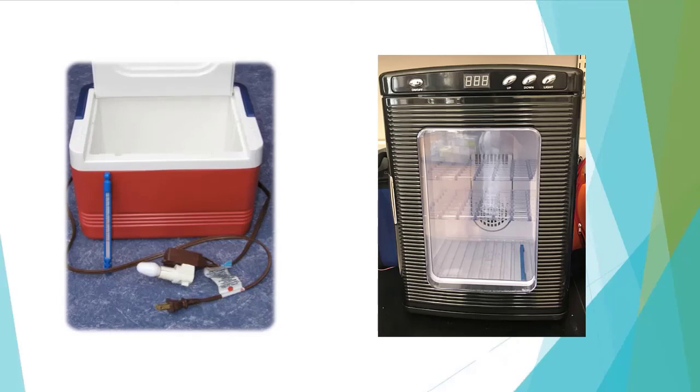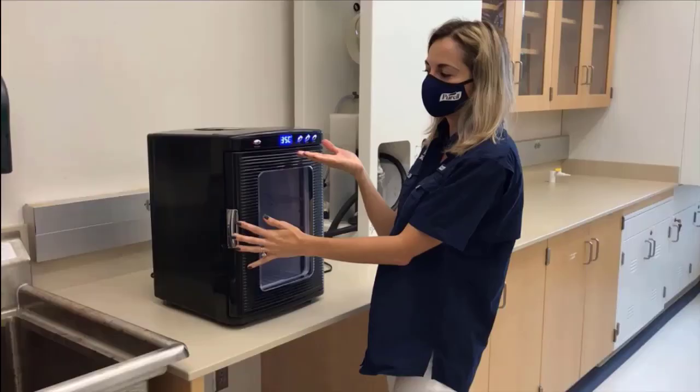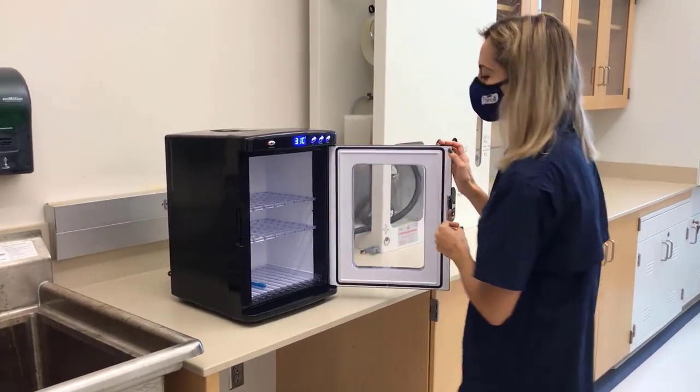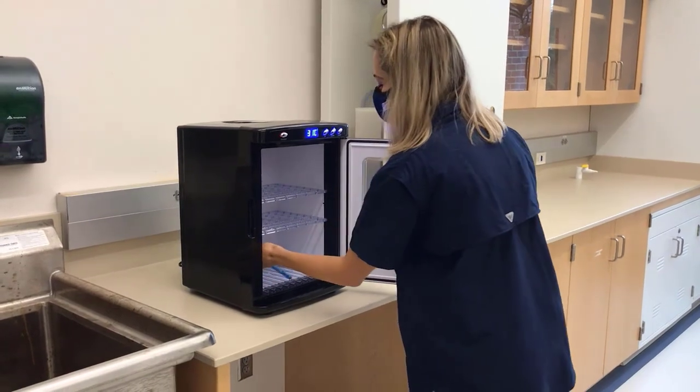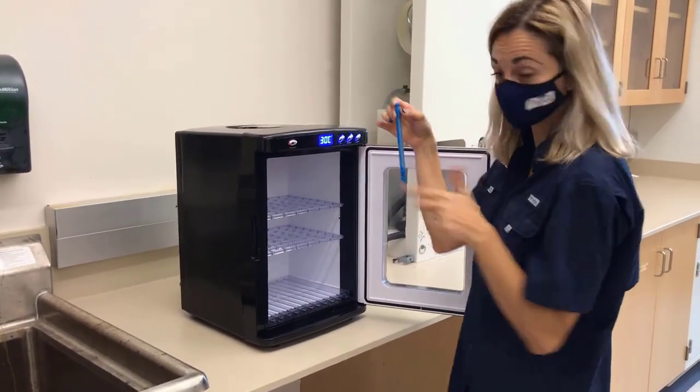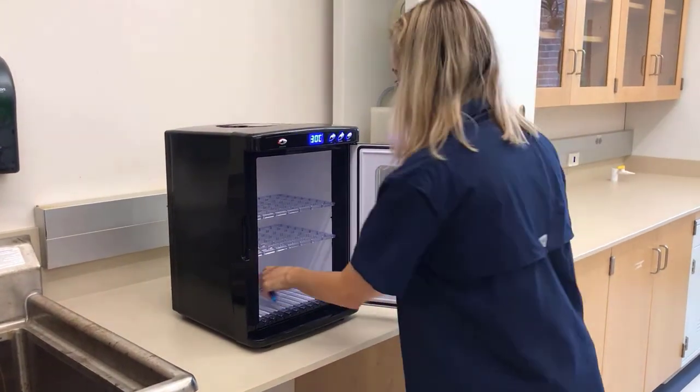Regardless of the type, you'll want to test out your incubator to make sure it is maintaining the desired temperature before you sample. Otherwise, you risk killing your bacteria with temperatures that are too high or inhibiting bacteria growth with temperatures that are too low.